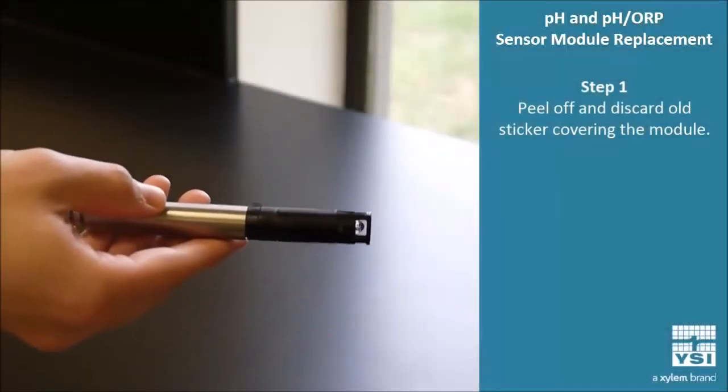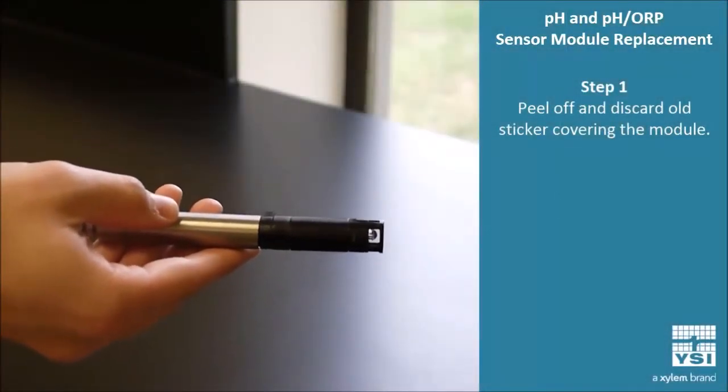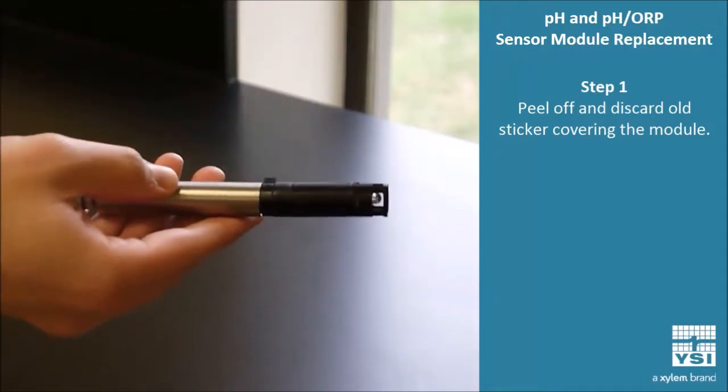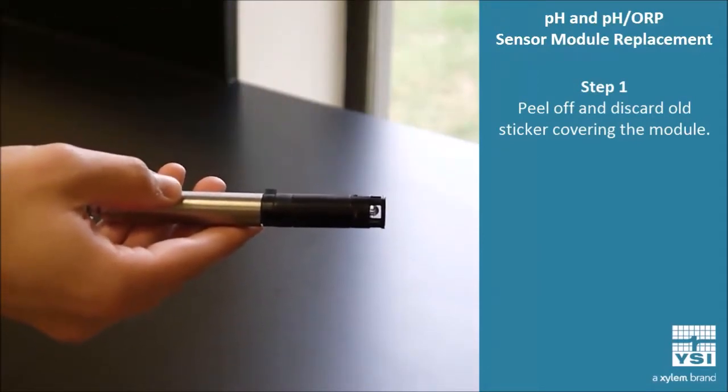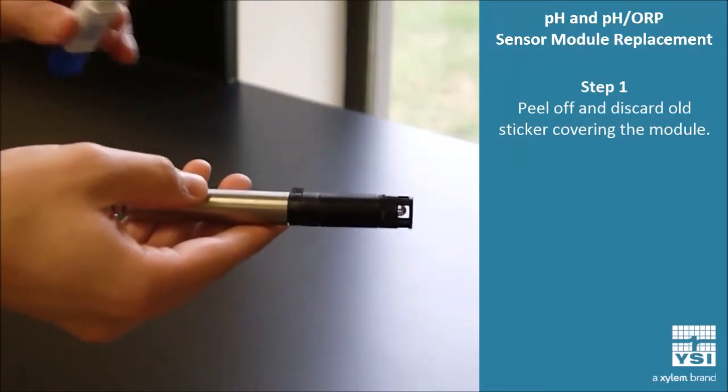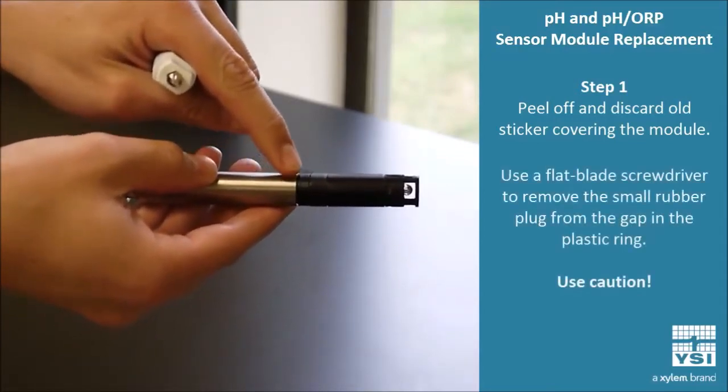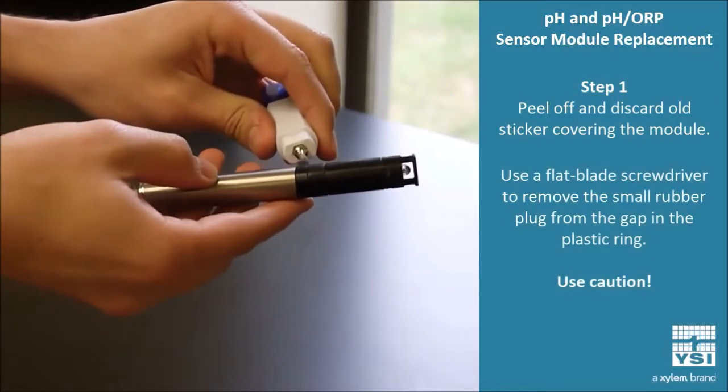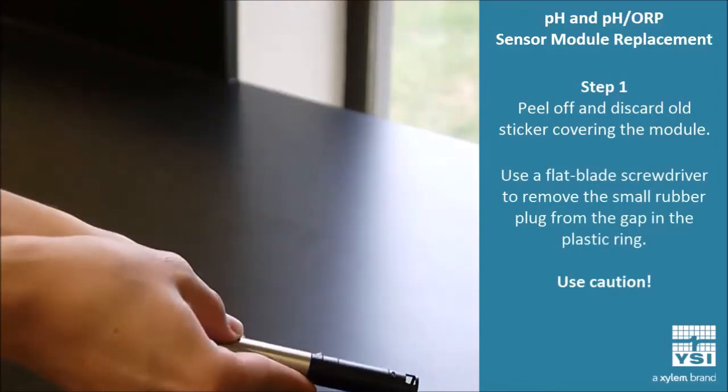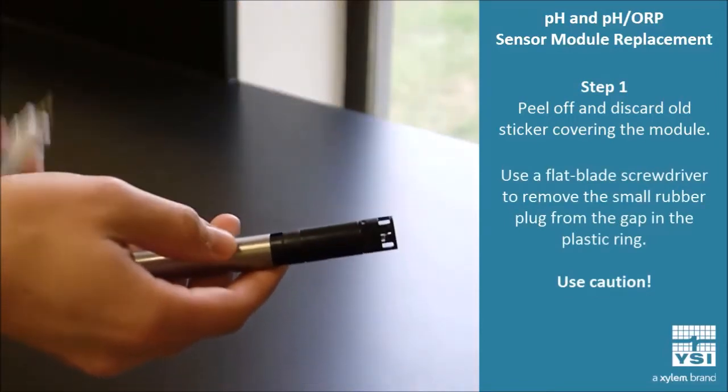The first step is to remove any old stickers that might be around the module, and once that's accomplished, you're going to use a flathead screwdriver to remove a small square plug in this first initial ring. Just dig in there. Be careful, though. Don't injure yourself.